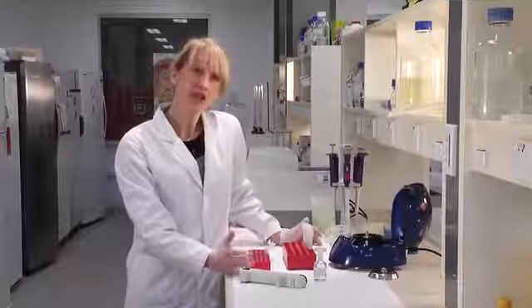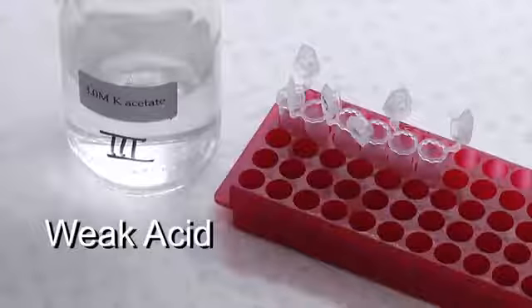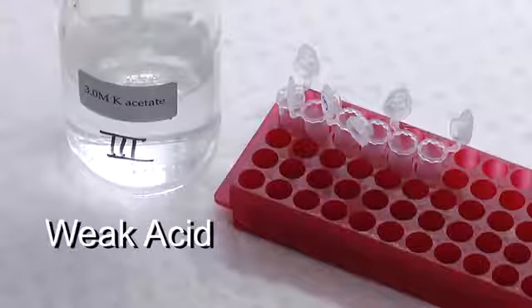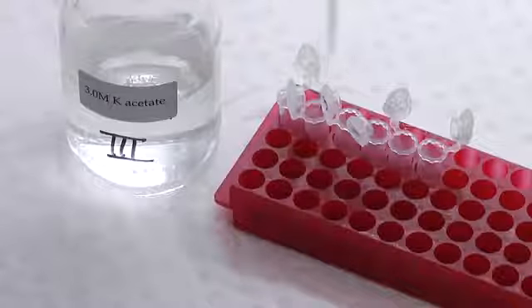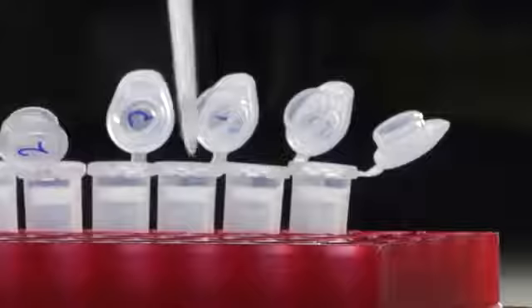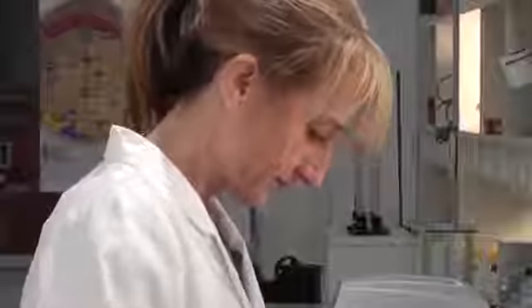And then we need to neutralise our solution. So we'll do that with a weak acid, like acetic acid. Neutralisation allows the plasmid to renature and become double-stranded and soluble once again. However, because the chromosomal DNA is so long, it can't renature. And then it's back in the centrifuge.